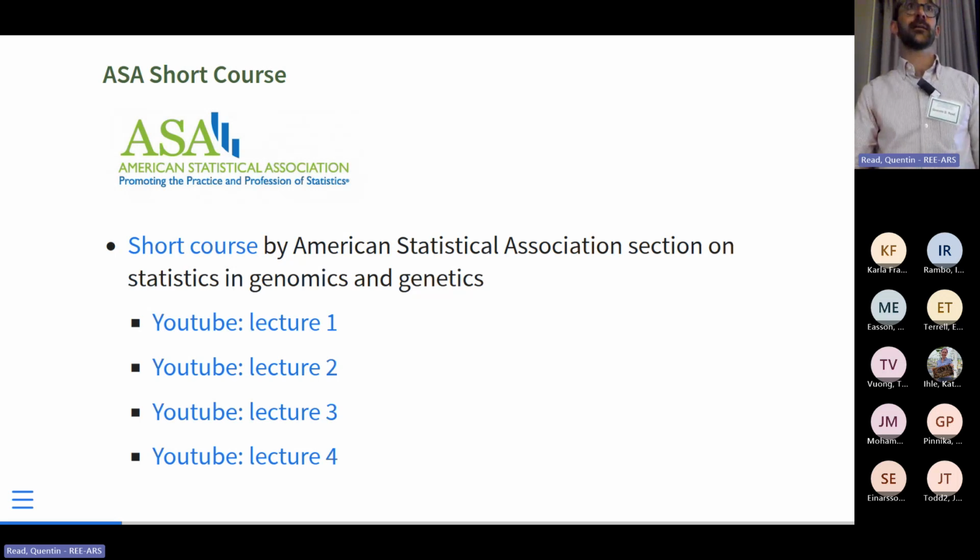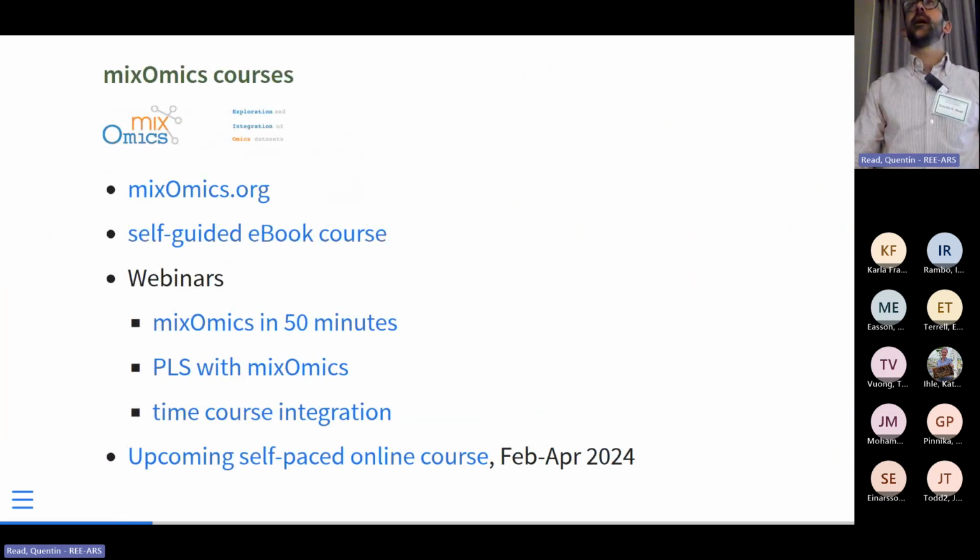So that's one that's out there. mixOmics is an R package that is a platform for omics analysis, and they have a bunch of self-guided courses. They have some webinars about different topics. They have, actually it's going on right now, a self-paced online course. Hopefully the materials from that will be available even after the course is over.